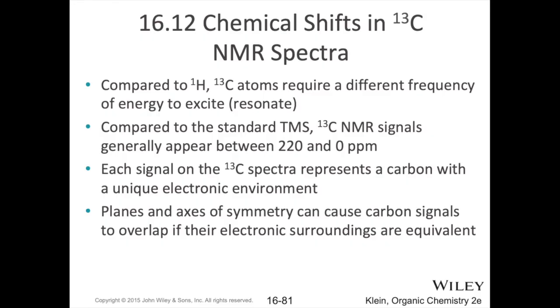So basically it's a much larger range, with just singlets in there. Seeing where on that range your singlets are, and knowing from your molecule how many signals you would expect, that alone should give you a lot of information.